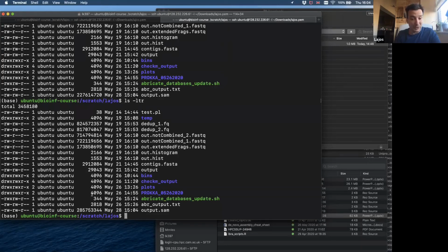So there will be, I think, a few minutes while it is running, because the SAM file contains almost everything, even a bit more than the FASTQ files. We will see soon. So yeah, I think it has to go up to 1.5 gigabytes at least, I think.